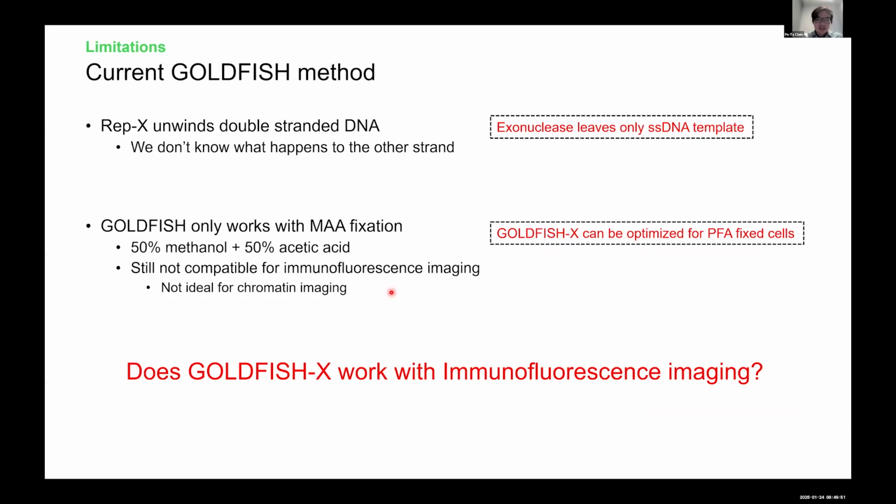So now I've shown that this new DNA FISH protocol can work with PFA-fixed cells. Our ultimate goal is to see if we can finally get DNA FISH to work with immunofluorescence imaging.